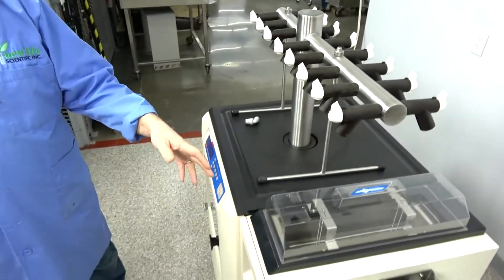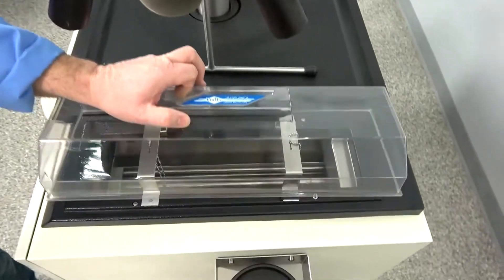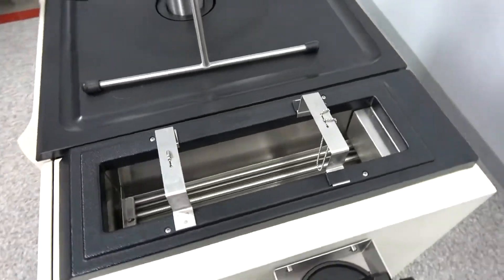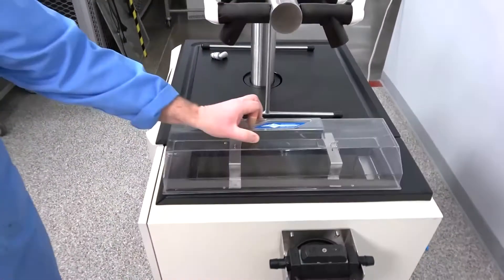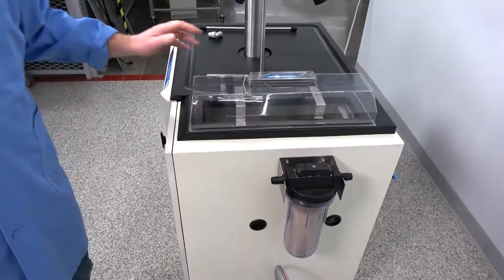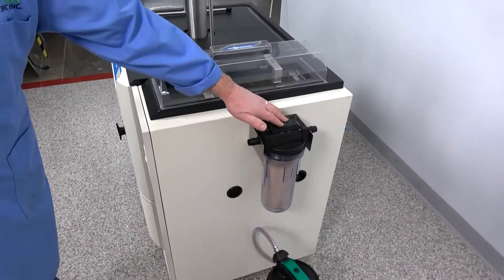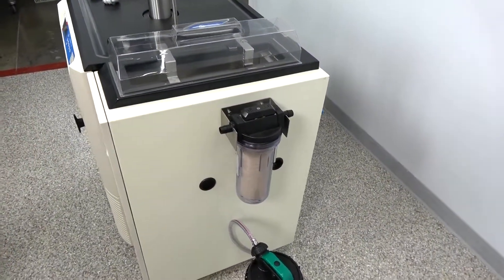This also has the freeze option on the end here, where you can pre-freeze all your jars, and that's working great. Everything's been gone through, tested for integrity, tested for reliability. This also has the filter option, which is not hooked up at this time, but I left it there in case you ever wanted to hook it up.